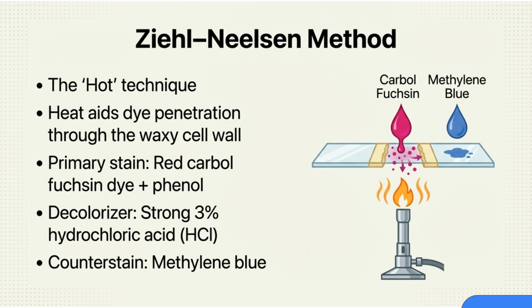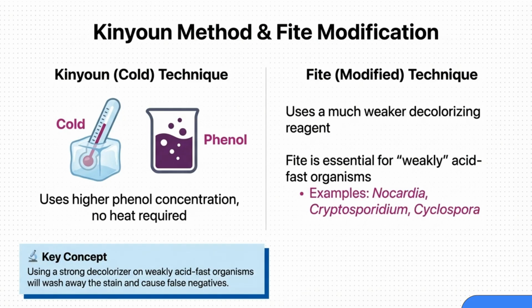A strong hydrochloric acid decolorizer is used, and methylene blue serves as the counterstain. The Kinyoun or cold technique uses a higher phenol concentration without heat. The Fite modification uses a much weaker decolorizing reagent, essential for detecting weakly acid-fast organisms like Nocardia, Cryptosporidium, and Cyclospora.